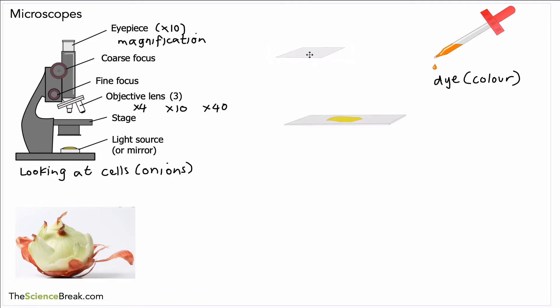The next thing you need is a smaller piece of glass, very thin, very delicate, so you have to be very careful with it. This is a cover slip. We would very carefully place the cover slip over our piece of onion or onion skin, keeping it nice and flat and being careful not to break it. We can then take our whole slide, place it under the microscope on the stage, and get it ready for viewing.